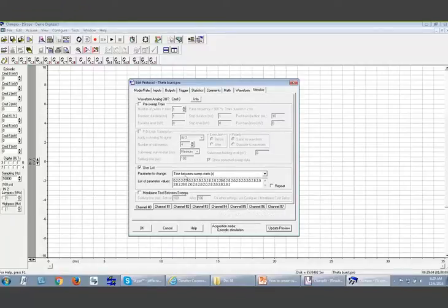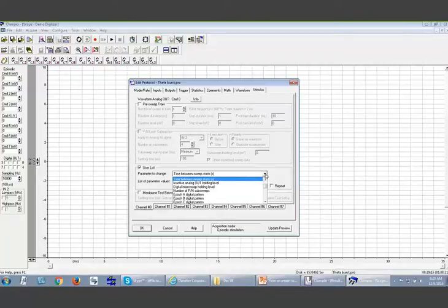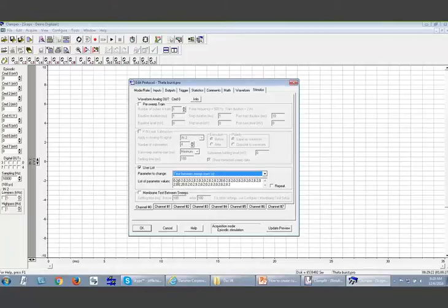What I need to do is change the time between sweep start. Now what I mean is that I want to monitor to hear the sweep. Okay, you go to stimulus, you select the time between sweep start, then you put 0.2, that means 200 milliseconds, right? So you need to type 1, 2, 3, 4, 5, type 9 times because it's in the epoch interval.